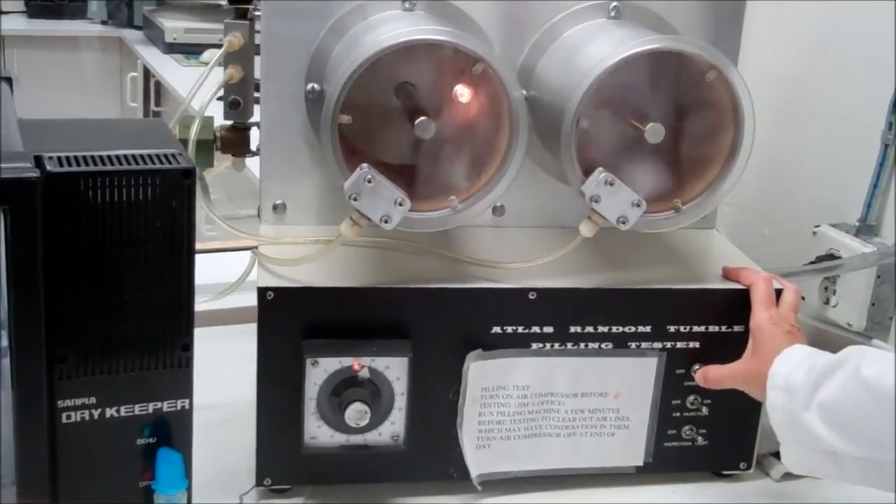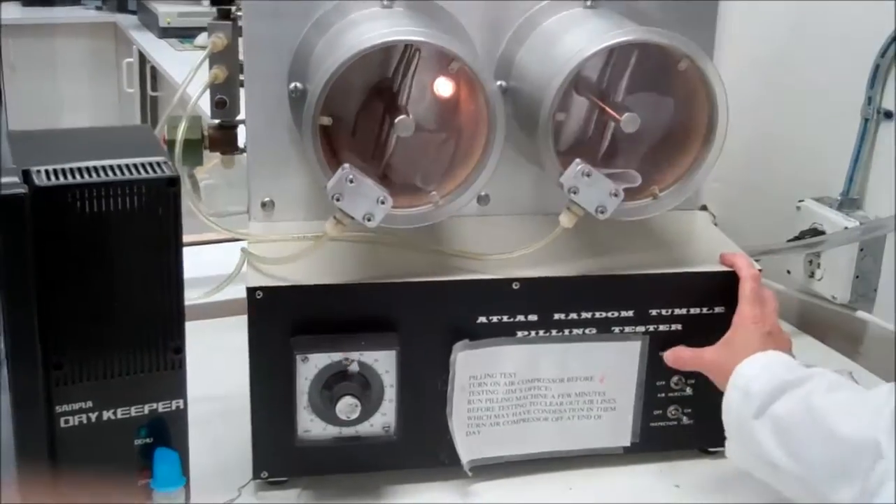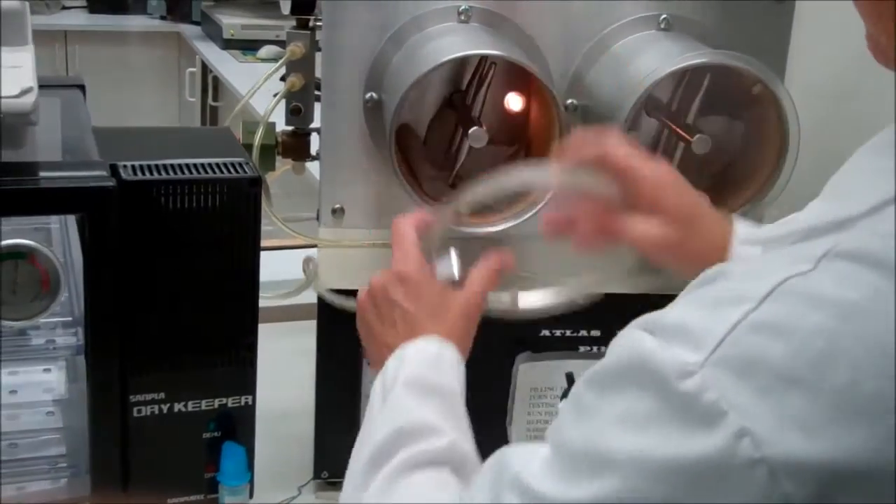We turn the pill test machine on and run for a 30 minute cycle. When the timer goes off, we switch tumblers and run for another 30 minute cycle.